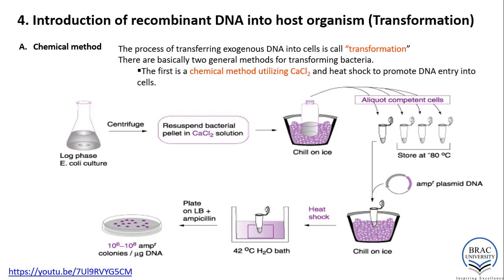Then there is a heat shock at 42 degrees for, I think, 90 seconds. When this heat shock is given, a thermal gradient is generated, and that thermal gradient facilitates the DNA moving into the bacterial cell. So this is a chemical transformation.